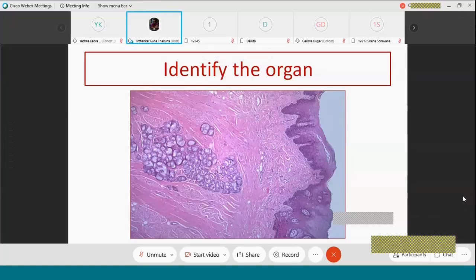The tongue is moved voluntarily. You can move the tongue in any direction you want. So tongue must contain skeletal muscle fiber. So a non-keratinized epithelium, underlying which there are skeletal muscle fibers, has to be tongue. But then you need corroborative proof. You can also see small glandular structures here. Can you name any small gland that can lie scattered in the tongue substance?